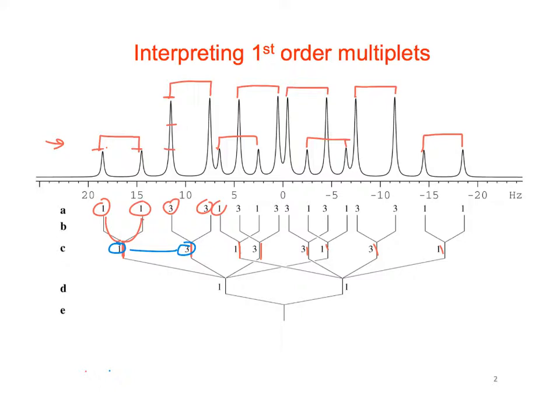Right? And so then this is 1 to 3 to 3 to 1. So those peaks are giving us a quartet. So we bring all of them together. There's another quartet here, here, here, and here. So we essentially have 2 quartets that are overlapped like this, and then each of those peaks was split into a doublet. Okay? This would be a doublet, quartet, doublet.